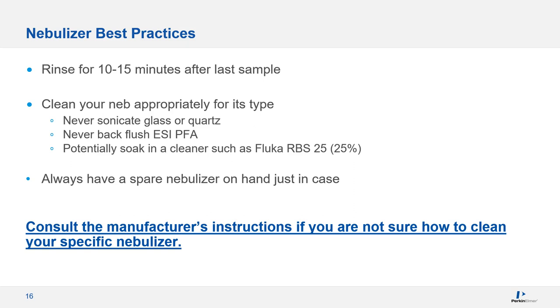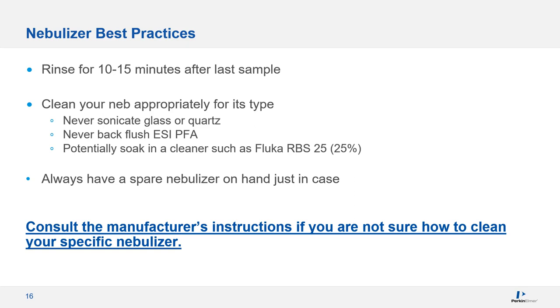When it's time to clean your nebulizer, you must use an appropriate cleaning procedure for your particular nebulizer. Not all nebs can be safely cleaned in the same way. Be aware that some of these procedures are very detailed and can require specialized equipment so that the nebulizer isn't damaged. One key thing to remember is never sonicate a quartz or glass nebulizer. The vibration from sonication will destroy the tiny sample capillary inside the nebulizer. In terms of ESI PFA nebulizers, you should never backflush them. You may, however, backflush the capillary leading up to it.